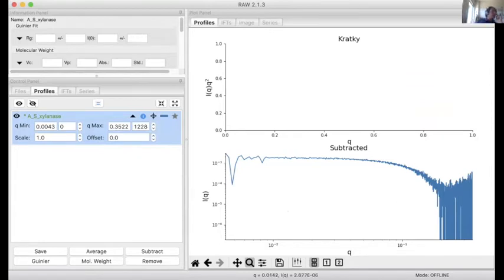Just a comment, if I may. Sure. But for the SIBYLS users, most likely also with these other beamlines, we do this processing for you, so besides the whole frames and also the HDF5 files, which can be directly plotted in RAW, we also give them the final merged data. But it's good to check our work in case you want to do it this way.